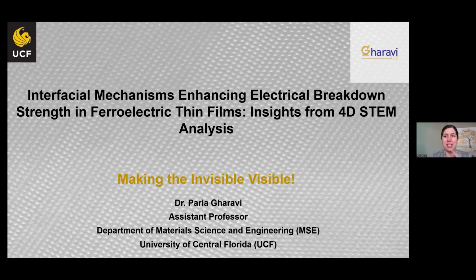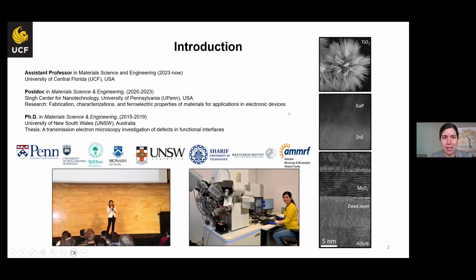So I really enjoyed all of the talks, and it seems that TEM has great applications in all different fields, including art, astronomy, physics, and for myself specifically, we can see the application of electron microscopy in electrical engineering. So today I'm going to talk about the origin of the enhanced electrical breakdown strength that we can see in ferroelectric thin films. And in this presentation, I use the 4D STEM technique.